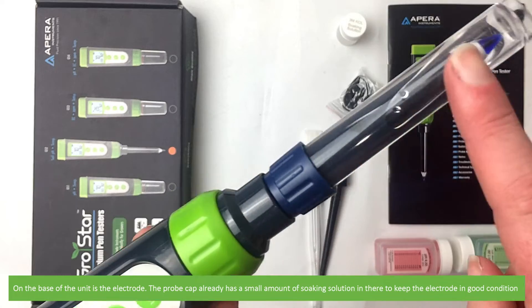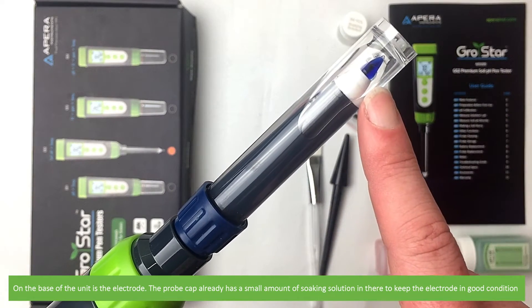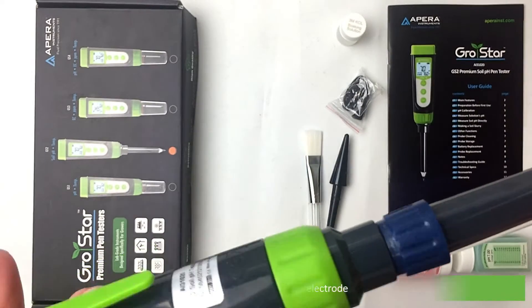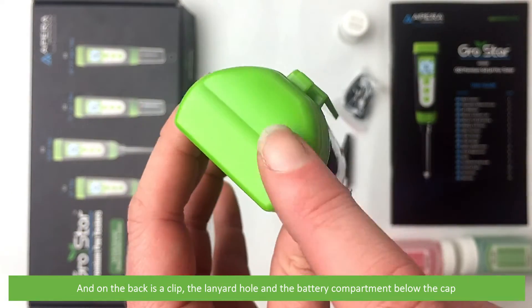On the base of the unit is the electrode. The probe cap already has a small amount of soaking solution in there to keep the electrode in good condition. On the base is the spear tip electrode. On the back is a clip, the lanyard hole, and the battery compartment below the cap.